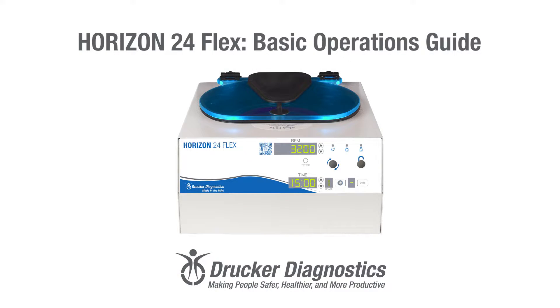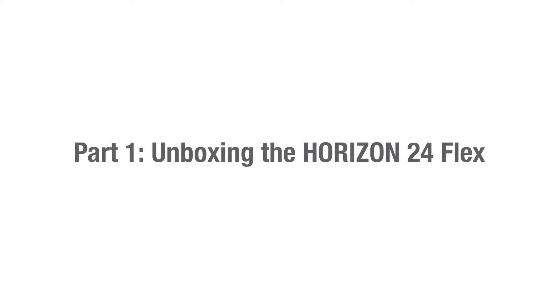Hi, I'm Dawn with Drucker Diagnostics, and today we're going to review the basic operations of your Horizon 24-Flex centrifuge. If you're looking for something specific, look at the bottom of your screen. This video is divided into chapters so you can easily find what you need. Horizon 24-Flex basic operations guide. Part 1: unboxing the Horizon 24-Flex.